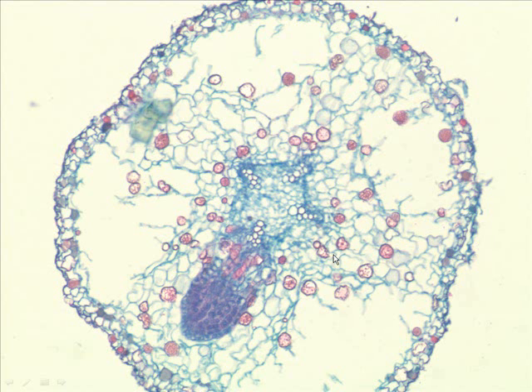All right. Here's another specimen. I guess if the other one was monocot, this one must be what? Dicot. But how can you tell anyway? It's got a central cylinder. Fact is, you can see these xylem ridges here, and here's a branch root developing between the xylem ridges or outside the xylem ridges? That's right, outside the xylem ridges.